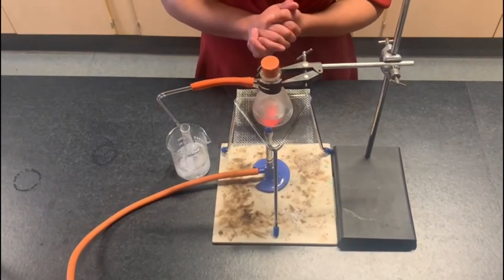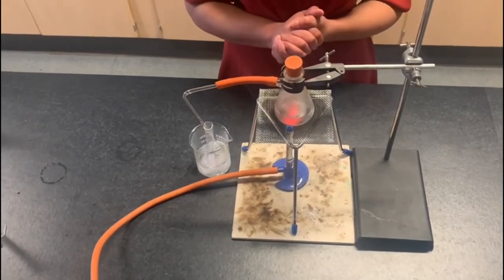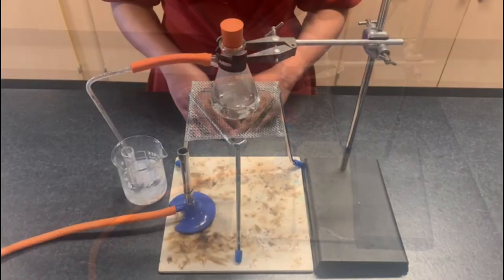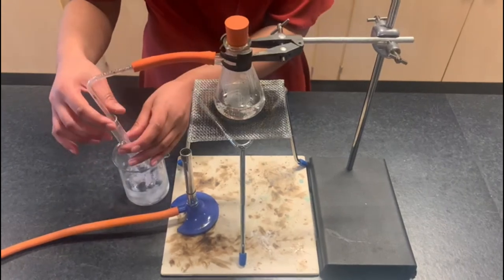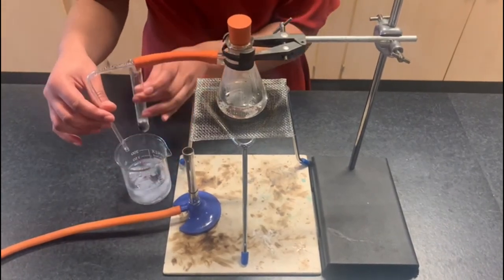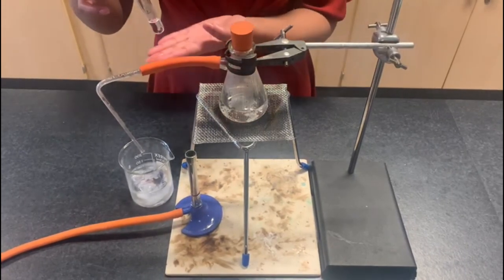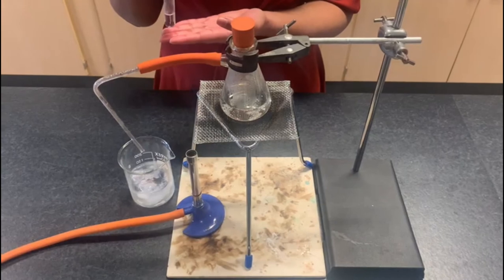While this is boiling, key thing you need to make sure is that the seawater is boiling gently. You then stop the Bunsen burner once you've collected about two centimeters cubed of sample.